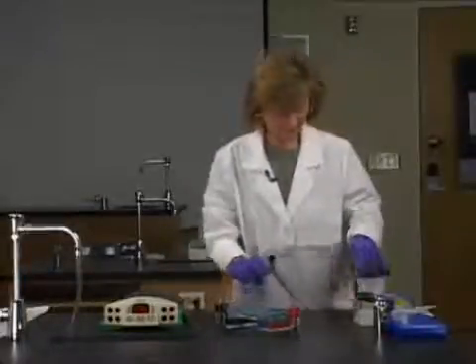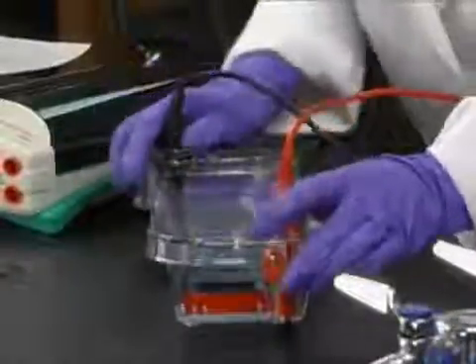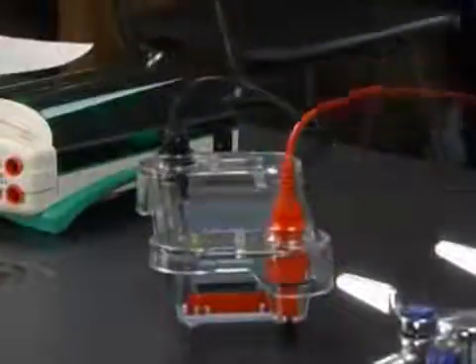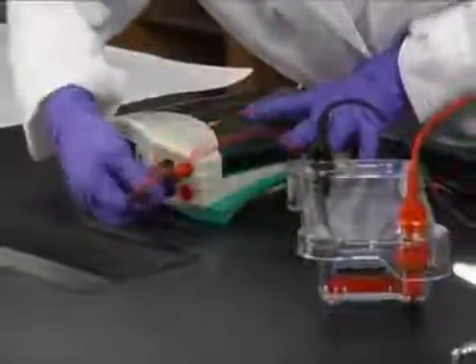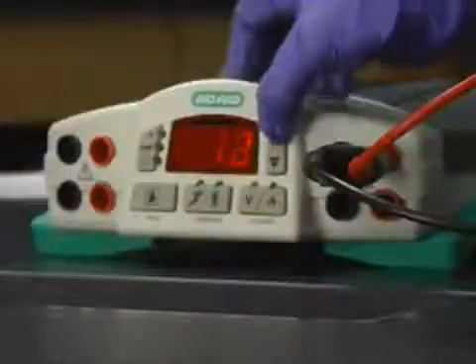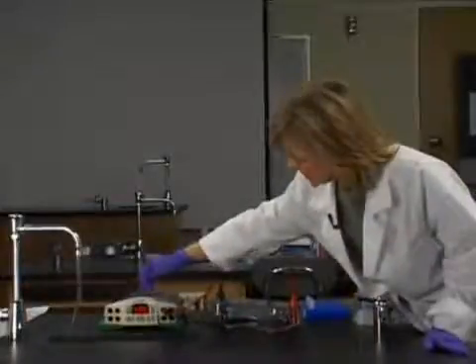We're ready to put the leads on. Black to black and red to red. This end is the negative end, and the red is the positive end. I want to make sure that we do the same in the front to connect those leads. I'm going to run this gel at between 100 and 130 volts. And when I've set the voltage, I'm going to hit the run button. And there we go. Now this can run between 45 and 60 minutes.